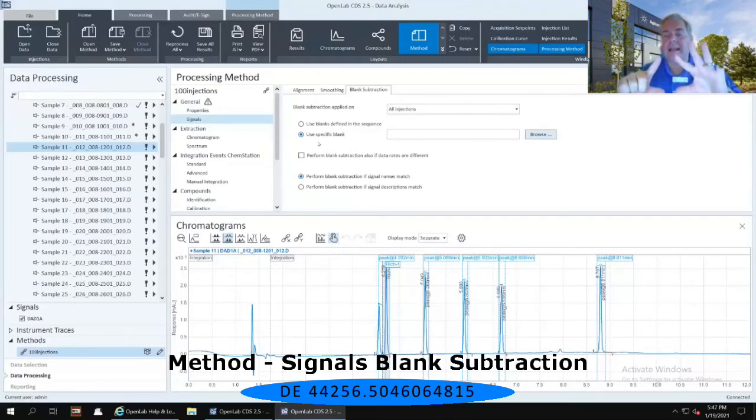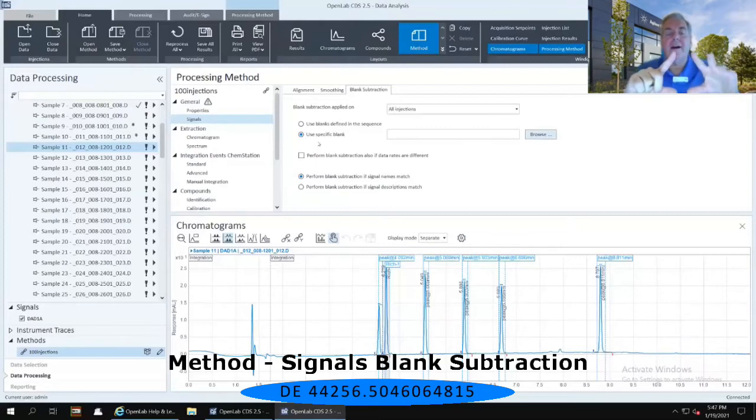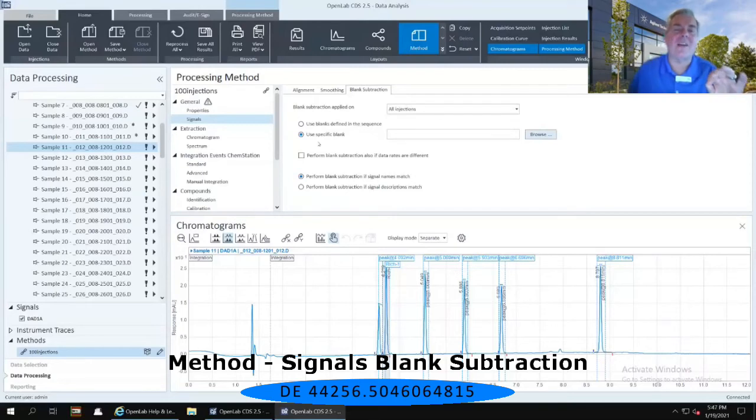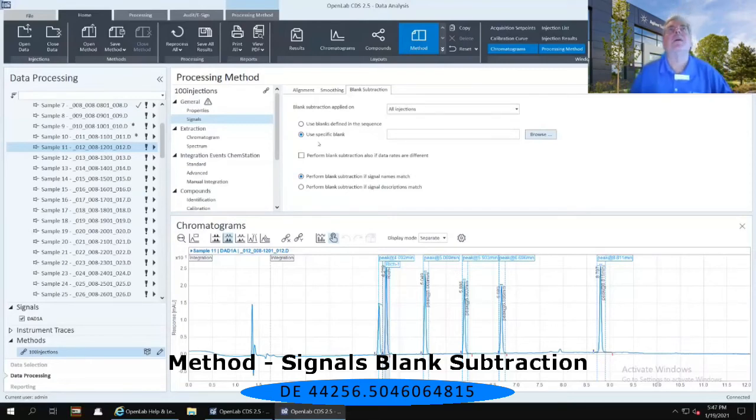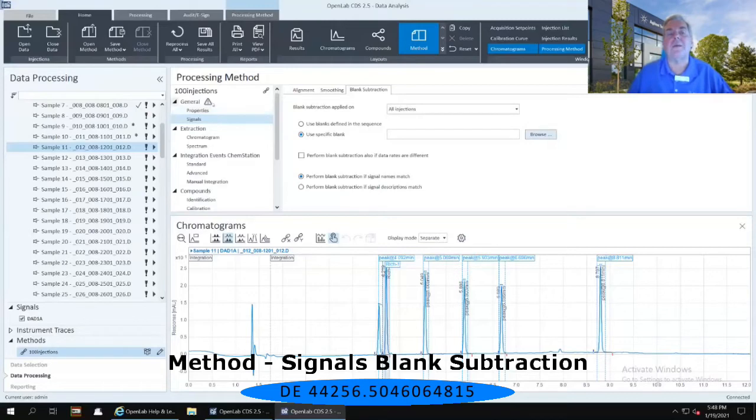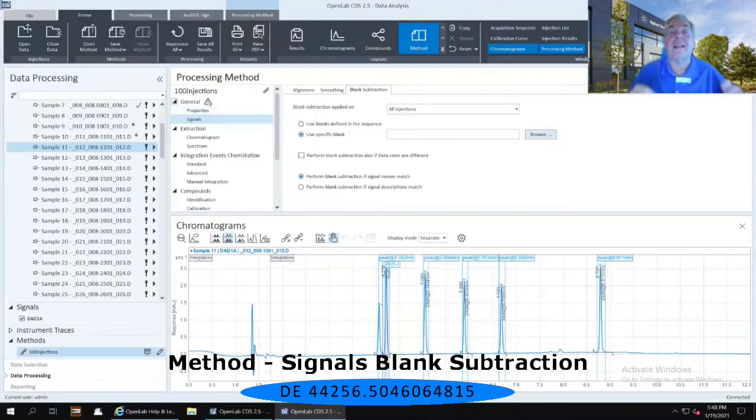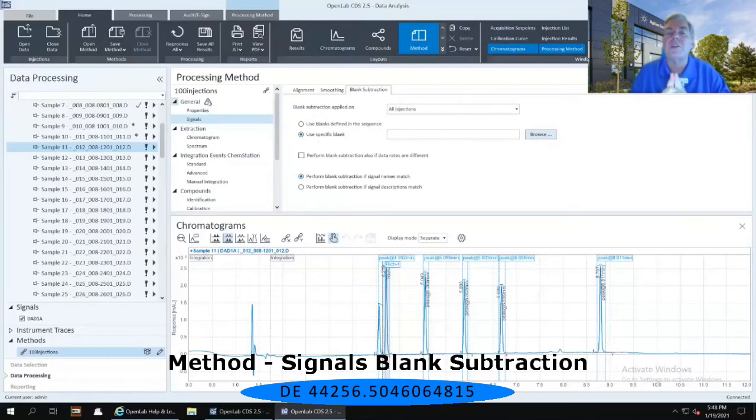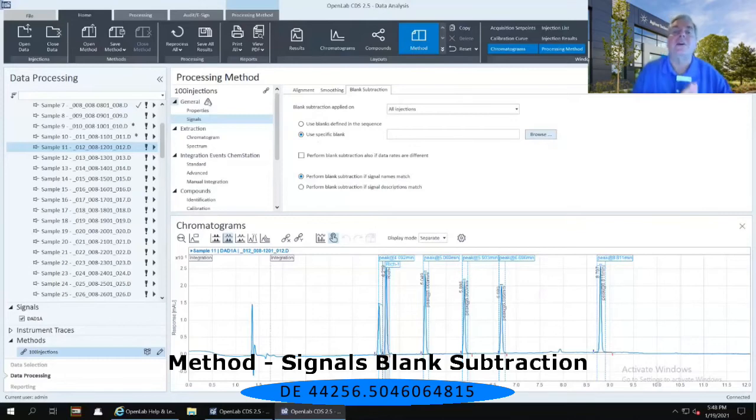Now, this is not an error, it is simply a guideline from the software that something needs your attention. So if I take my mouse and I hover over that icon immediately to the right of that, it says that the blank subtraction, the specified blank is not identified. And that's because in that list of injections on the left-hand side, not one of those injections was actually identified as a blank.